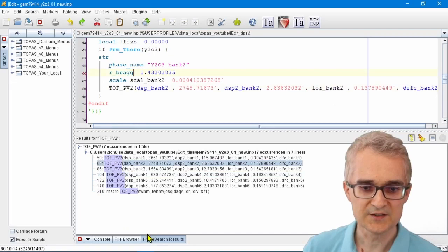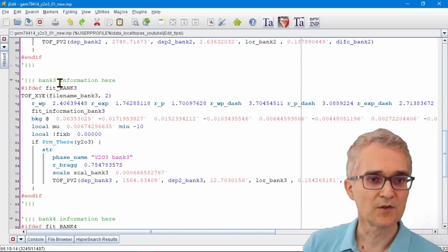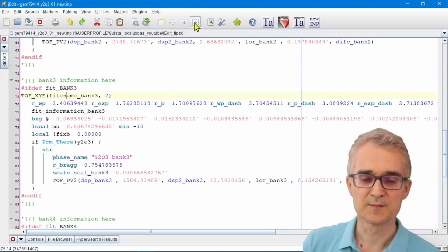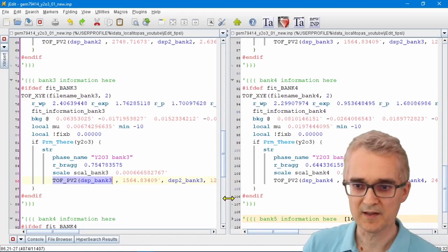The other thing that's really useful when you're looking at complicated files is using the split screen feature in jEdit. Let's say I want to look at the information for bank three and bank four simultaneously. If I click on this little split screen icon in jEdit here, I can see the same file in two different places on my screen. Here's the information for the peak shape in bank three and here it is in bank four.